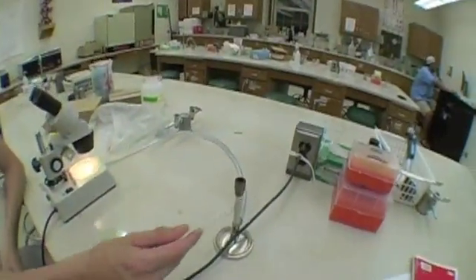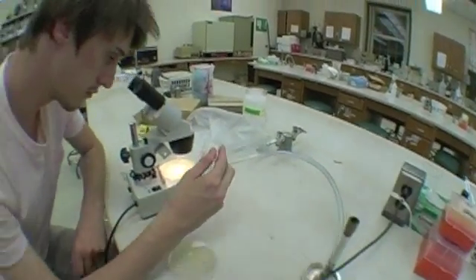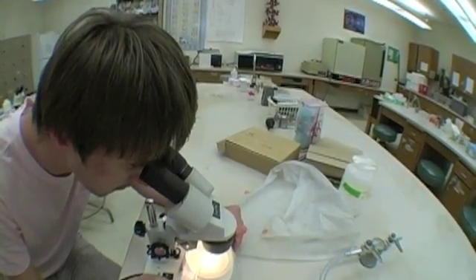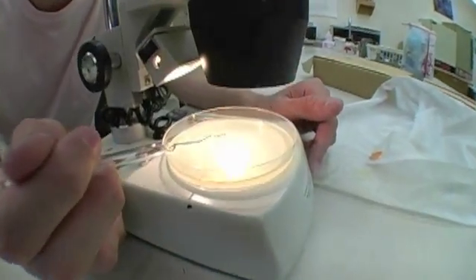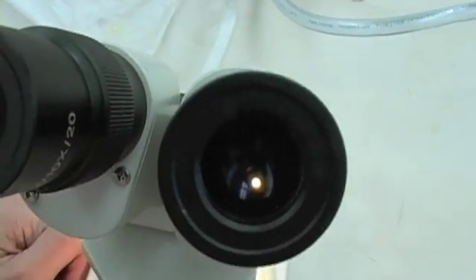At this point, flame your worm pick. It cools down very fast. At this stage, make sure you do not stab the worm. Gently find the worm of your choice and tap it with the worm pick. This is how the worm appears under the microscope.